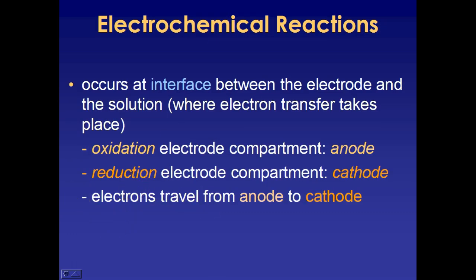Electrochemical reactions occur where, until you have that electrical current connecting them, you're not going to see the electron transfer occur. You have to be able to have the two pieces together. We needed the salt bridge connecting the two electrodes, the two wells, so that the charge buildup, because one would become positively charged and one negatively charged, doesn't happen. That salt bridge allowed ions to move between them to balance out the ions being lost. Okay?